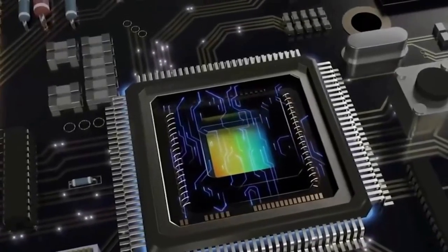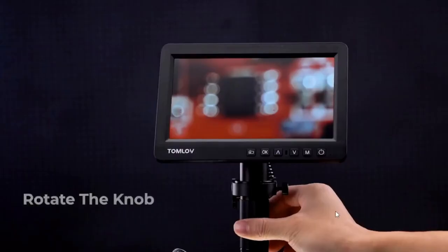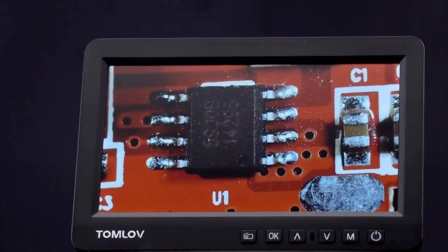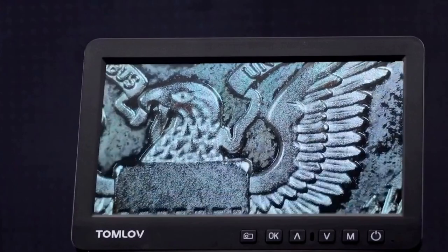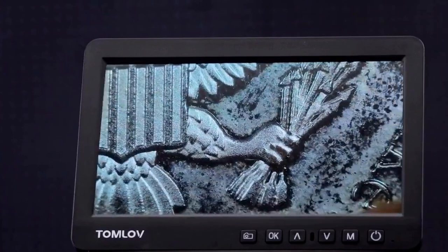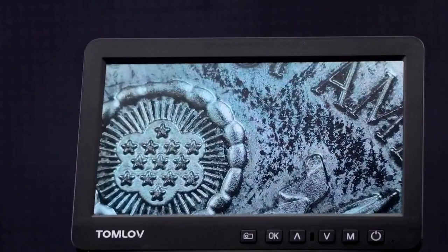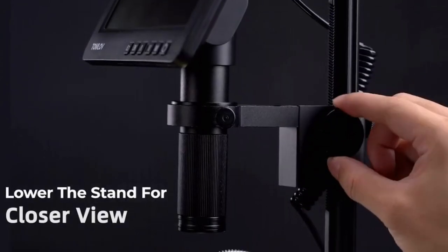The DM209 boasts a powerful 2K HDMI output that delivers breathtakingly clear and detailed images. With its built-in Sony CMOS IMX sensor, it reproduces textures and details in real-time, offering you true-to-life visuals. Whether you're capturing stills or recording videos, this microscope guarantees richer tonal gradations and more realistic images. The sensor's high-speed processing capabilities ensure no details are left unseen.